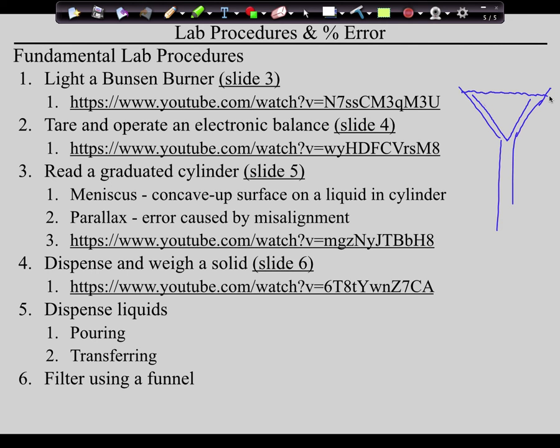In a graduated cylinder, these are more carefully cast, and they're actually accurate to about 0.1%. And we have other glassware that's accurate out to like 3 decimal places. So these are rough ideas, but they're never perfect, okay? You guys okay on all of this?